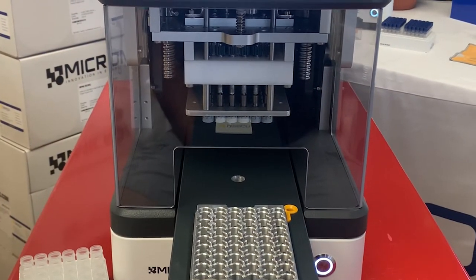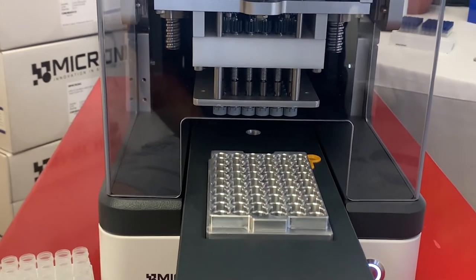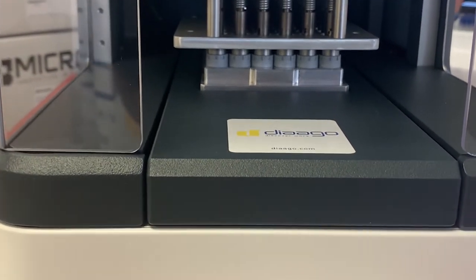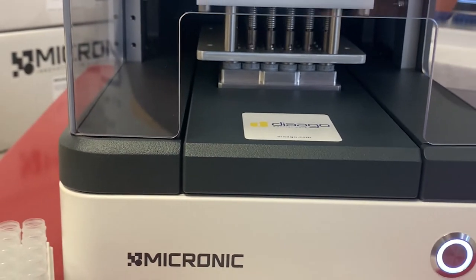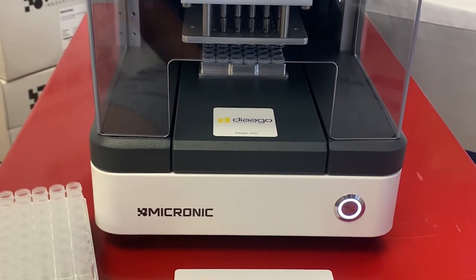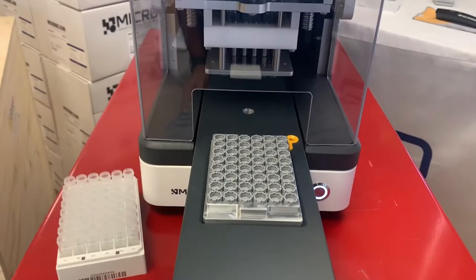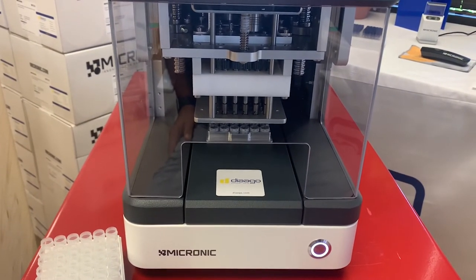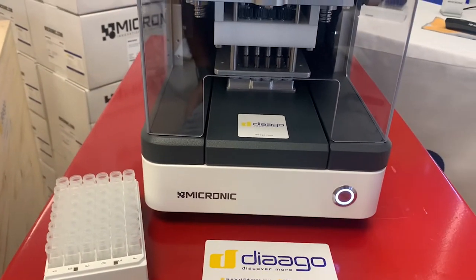The unit can also unload the screw caps onto a cap carrier in order to clear the heads for decapping more racks at the same time. It can then load the screw caps back on the heads and recap the uncapped rack.